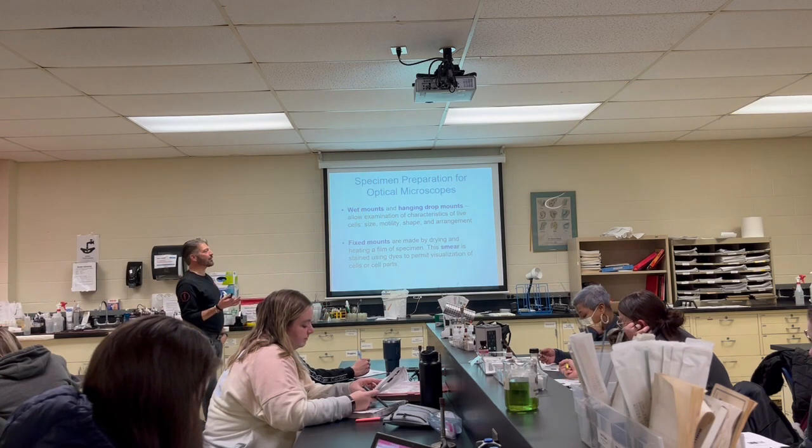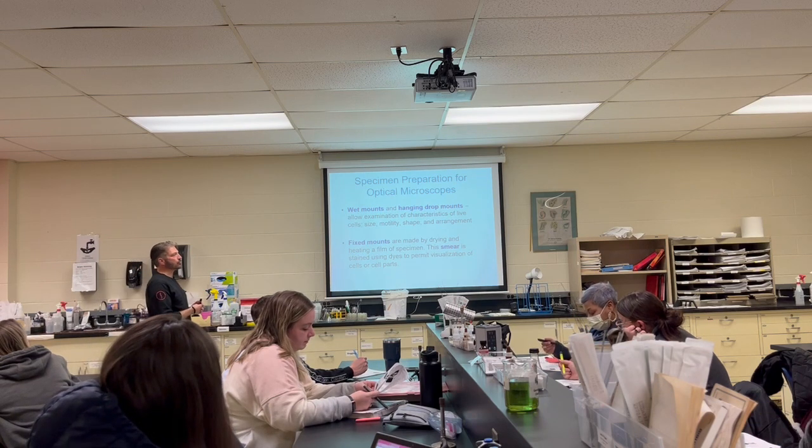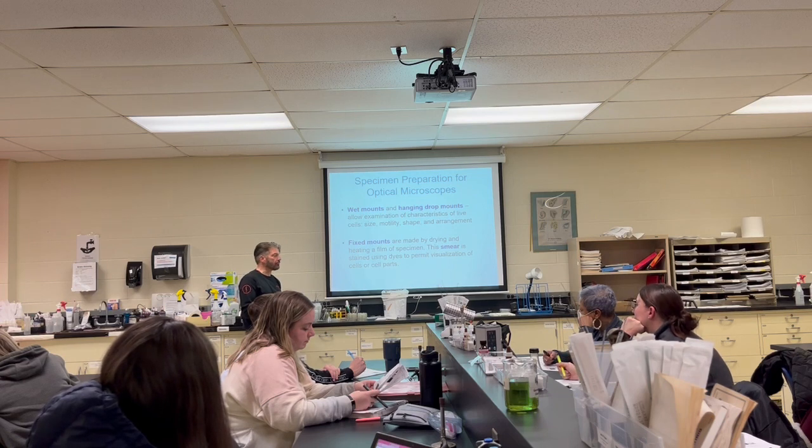Okay, so let's get to something that's actually fun and important: wet mounts and hanging drop mounts. We can do these if anyone wants to, but we're not going to be looking at pond water and things like that. I'm going to focus on things that are microscopic that you'll see in healthcare.